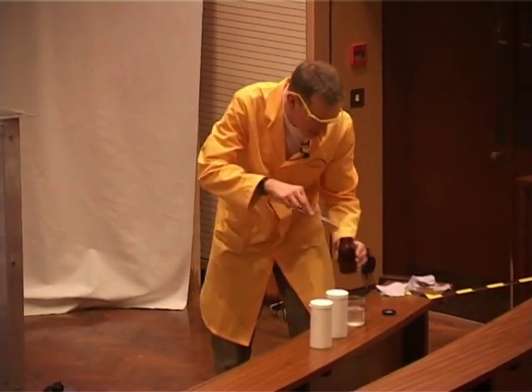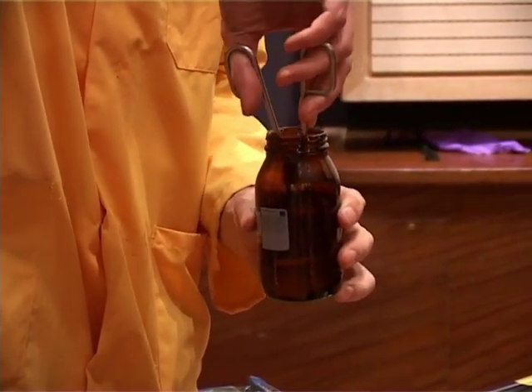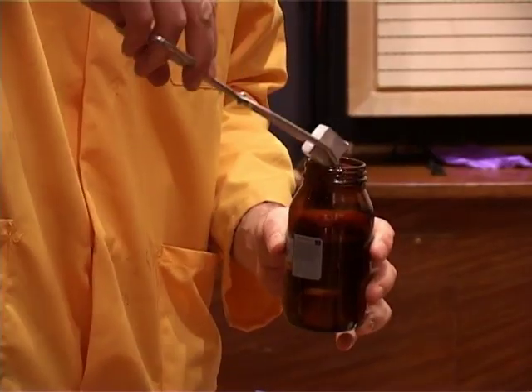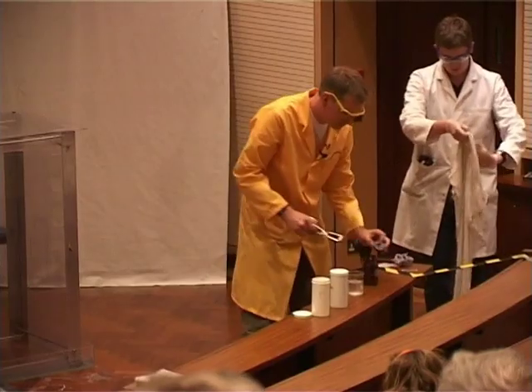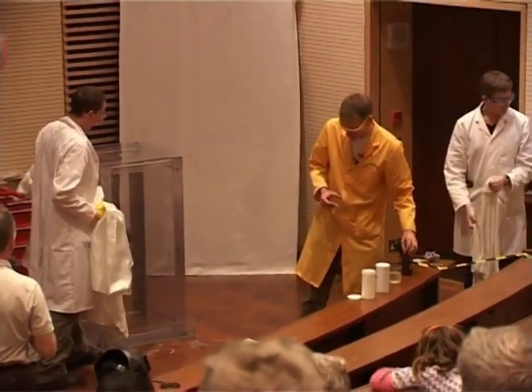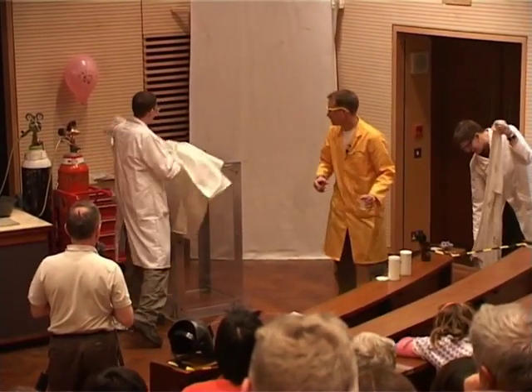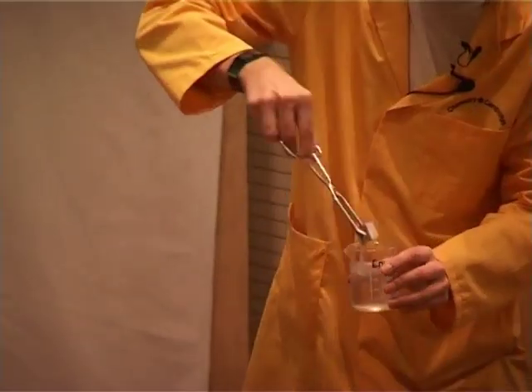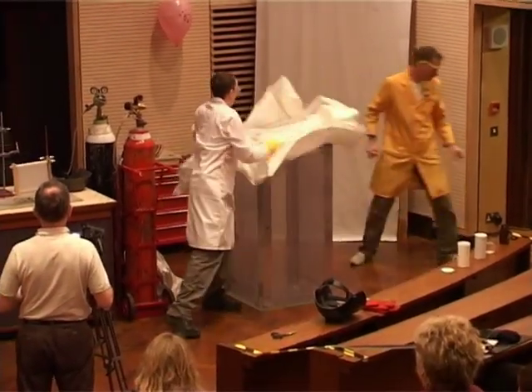So remember, sodium is a metal. I have a lump of sodium here. And we're going to add this to the water in the tank. I'm just going to wash this. This is in alcohol, right? And we're going to drop this into the water at the bottom. Are you ready? And then get back.